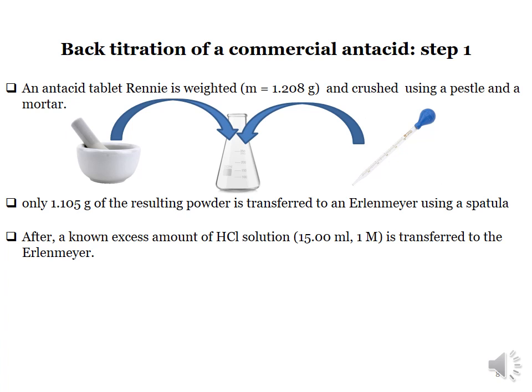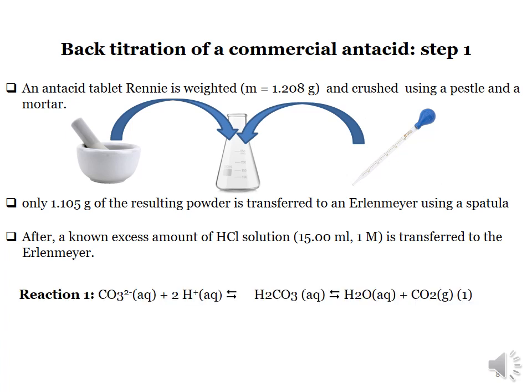Here we need to think about number of moles. Yes, the number of moles initial added to the tablet. Then a reaction will happen. The carbonate from the Reni tablet will react with the acid to give carbonic acid, and the carbonic acid will dissociate into water and carbon dioxide.